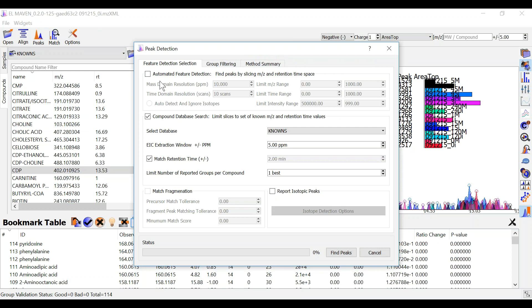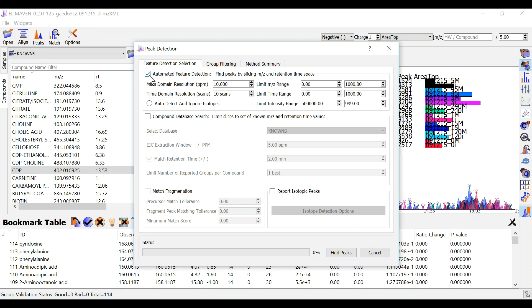The first setting does not use the compound database. When you check this ElmAven will perform untargeted peak detection for you.